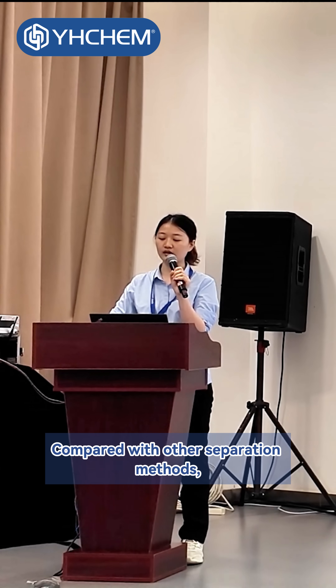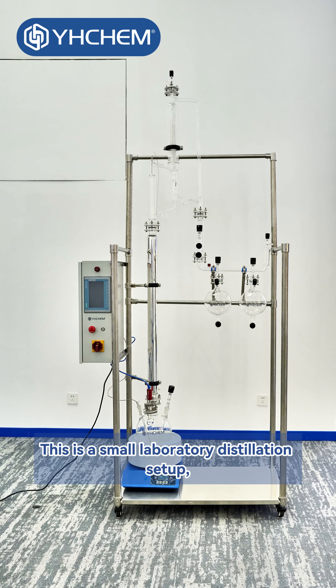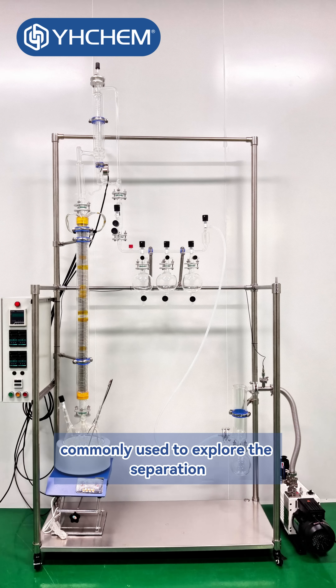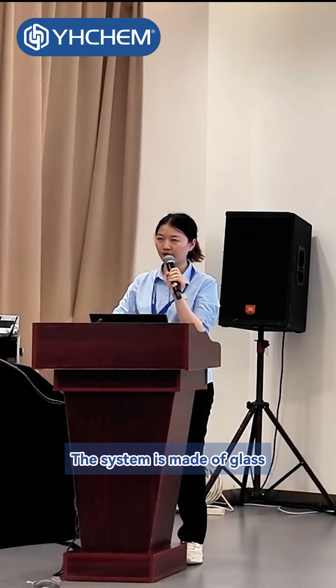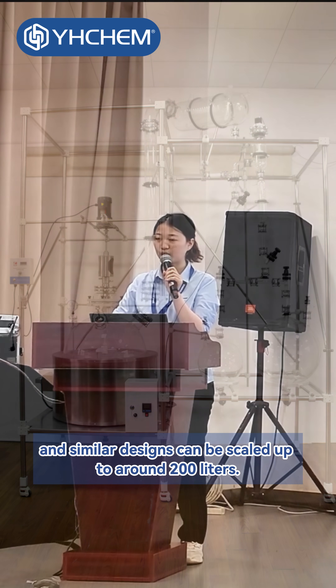Compared with other separation methods, distillation has a much higher upper limit in terms of achievable purity. This is a small laboratory distillation setup, commonly used to explore the separation and purification of reaction products. The system is made of glass, and similar designs can be scaled up to around 200 liters.